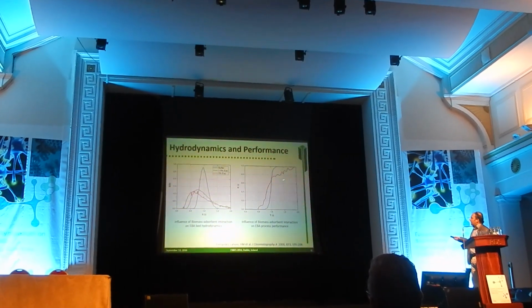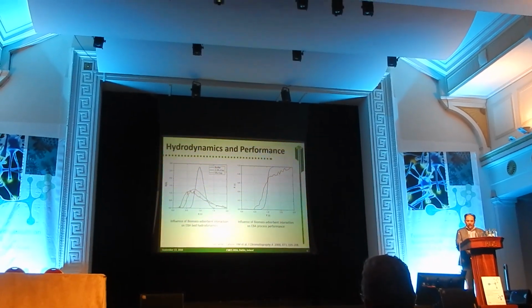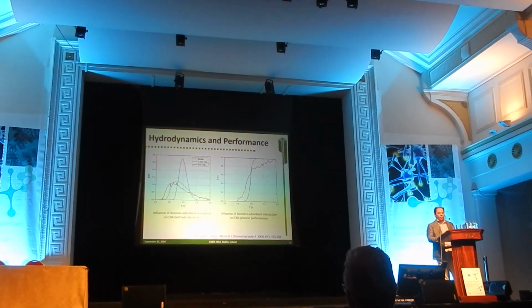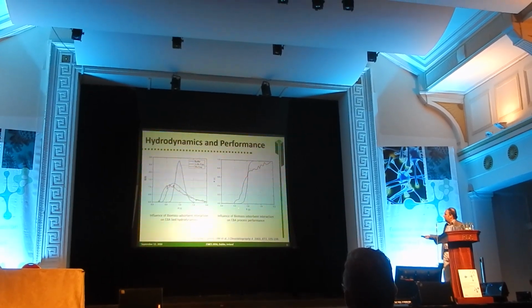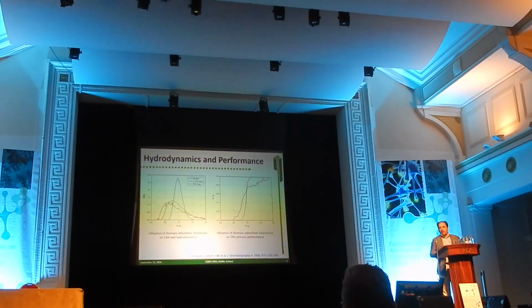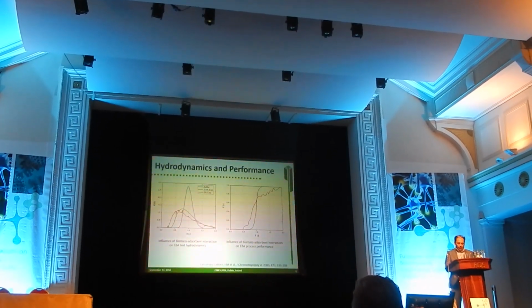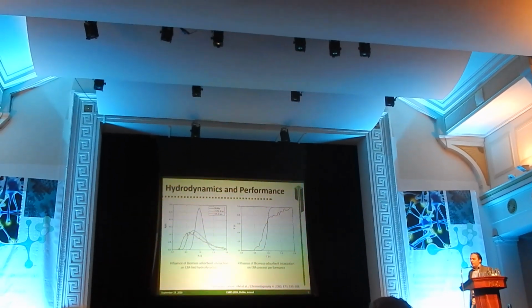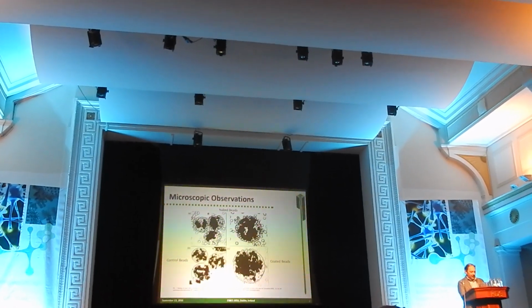This also translates into a much worse breakthrough curve, and if you calculate dynamic binding capacity at 10% of the breakthrough, so basically at this point here, more or less, you will see that here you are getting much less capacity than here, right? So the net consequence of this again is that you are spending a lot of money in buying these materials and you are using only half of the actual capacity, which would, of course, become a cost factor.